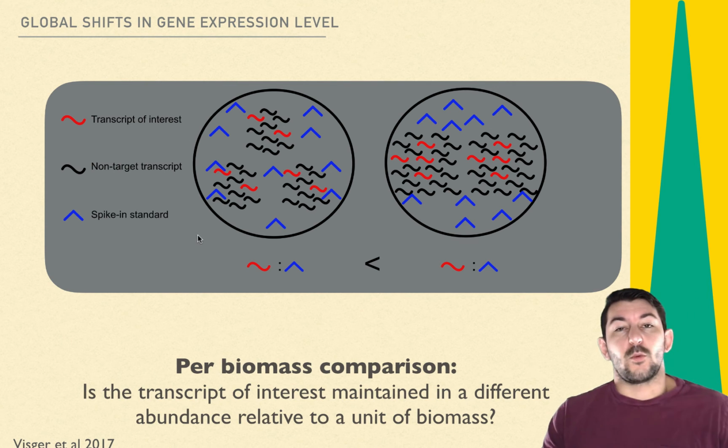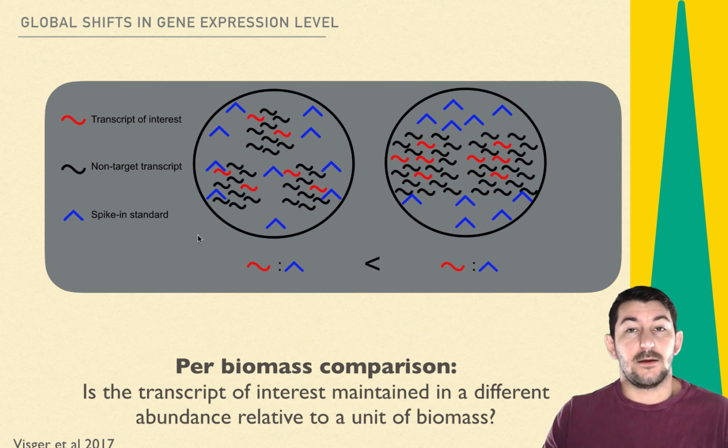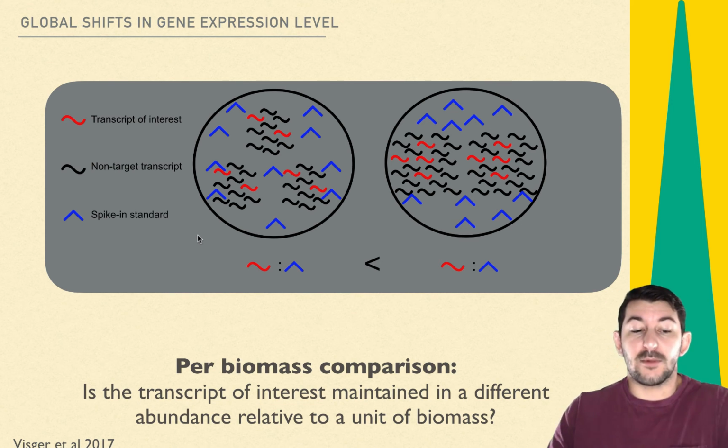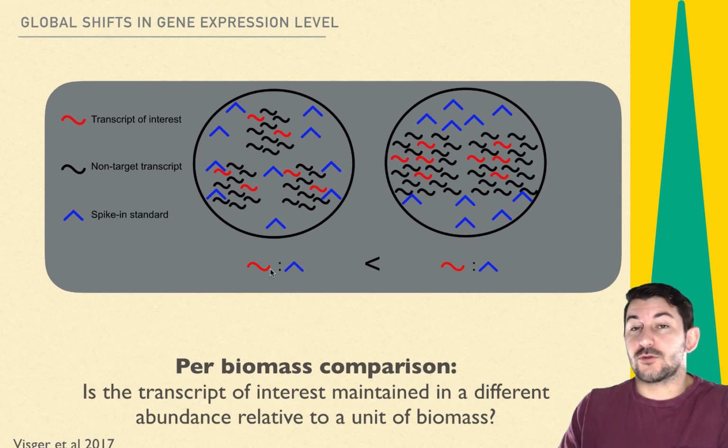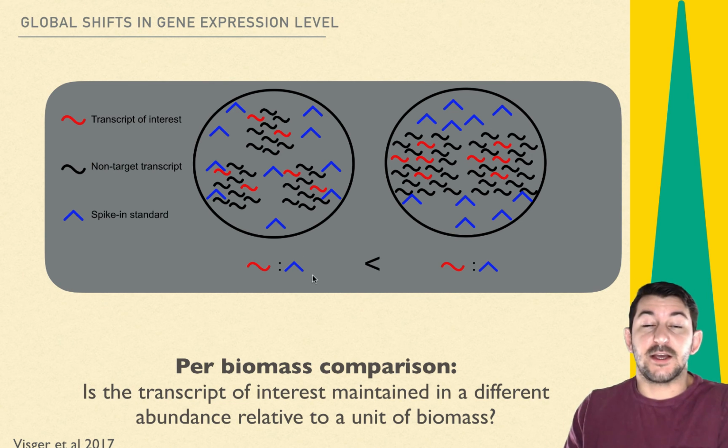Here, we're not going to account for cell differences. We just extracted from equivalent volumes of tissue, spiked it based on that volume of tissue, and then normalized by dividing the total transcripts sequenced by the total of the spikes that were sequenced. So we're basically, again, just pulling together by those triangles.